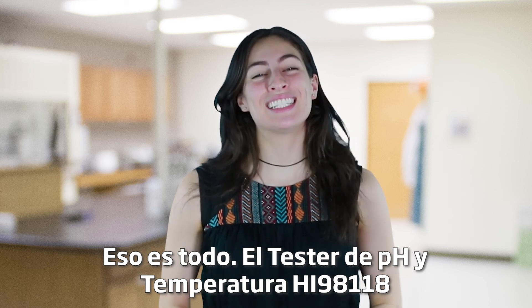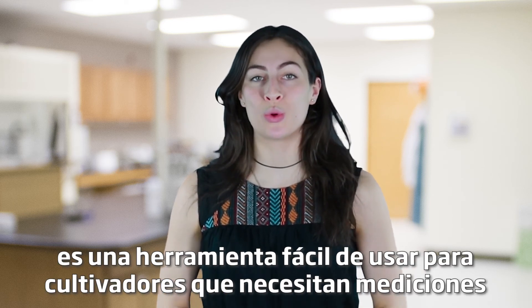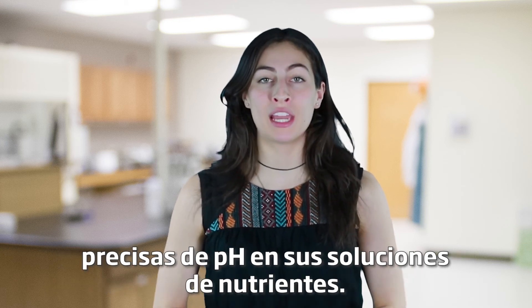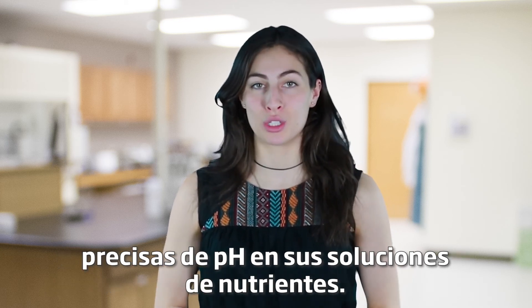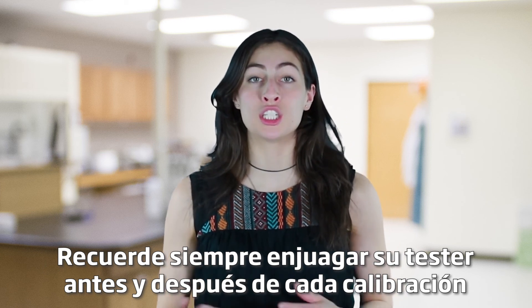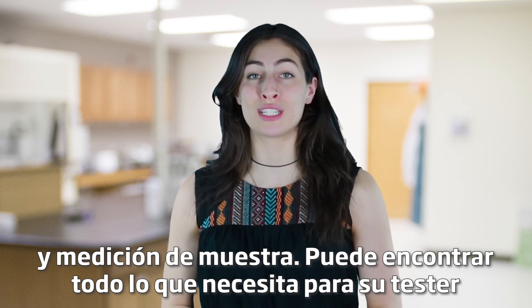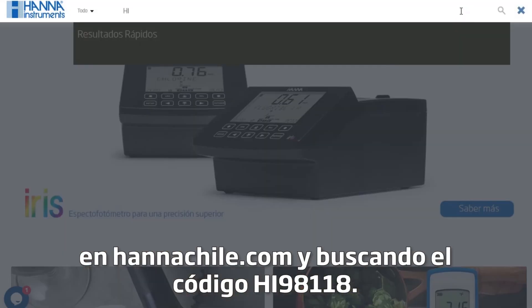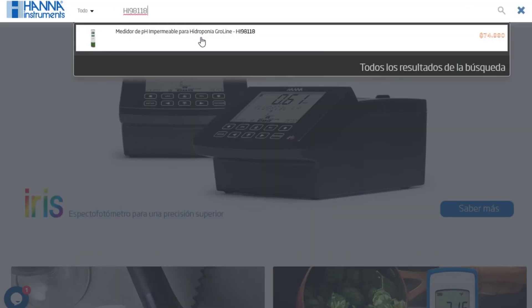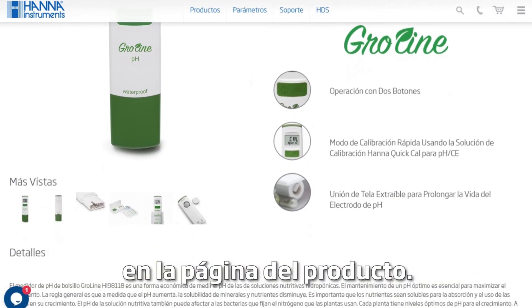So that's it! The HI-98118 pH and Temperature Tester is a simple to use tool for growers who need accurate pH measurements in their nutrient solutions. Remember to always rinse your tester before and after each calibration and sample measurement. You can find everything you need for your tester at hannainst.com/HI98118. Buffer solutions and other products can be found right on the product page.